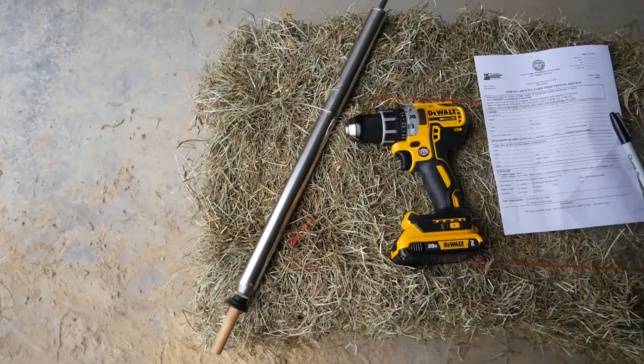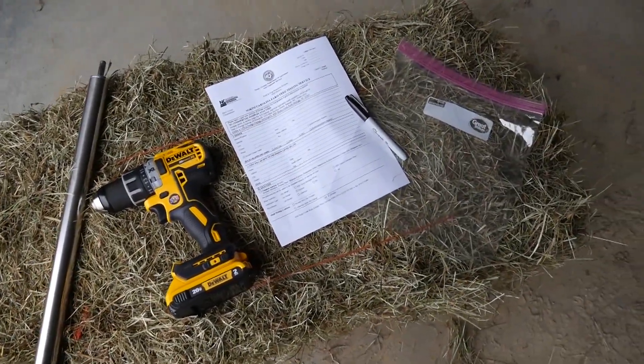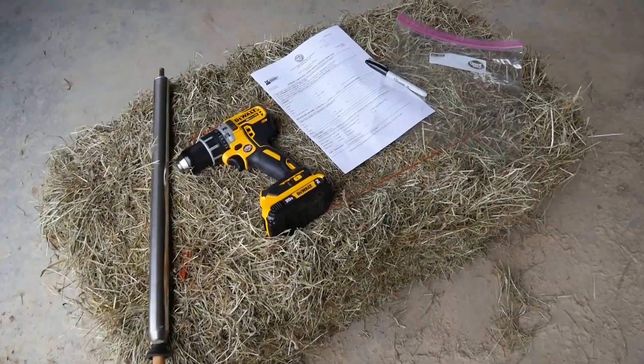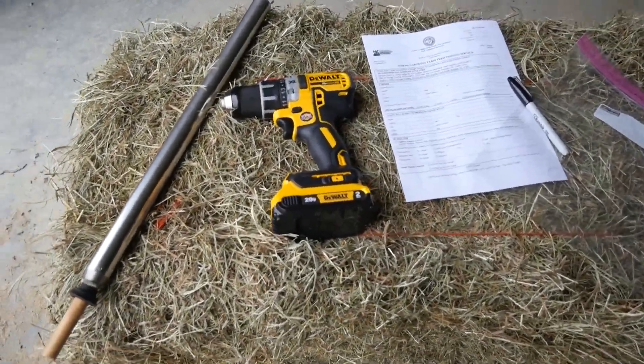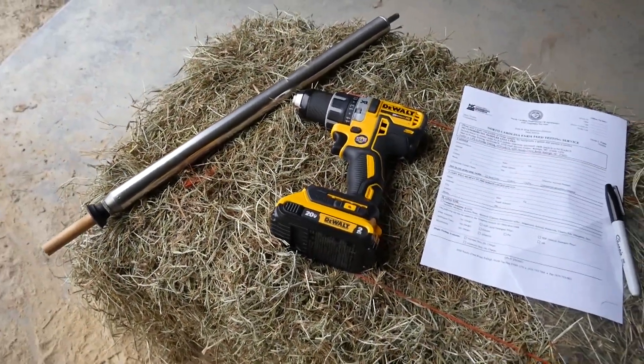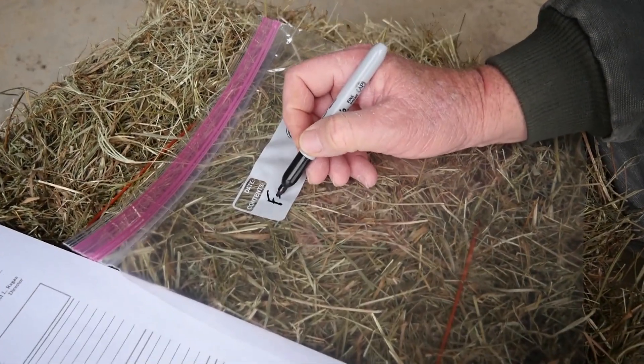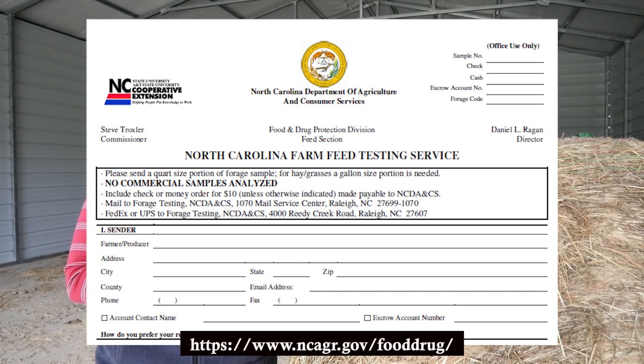You need a few things to get started. You're going to need your hay probe, which you can get from your local Extension Center. You're going to need a cordless drill, a gallon-size Ziploc bag, a marker to properly label the bag, and then the NCDA forage testing form.